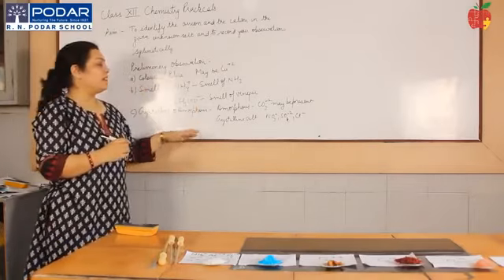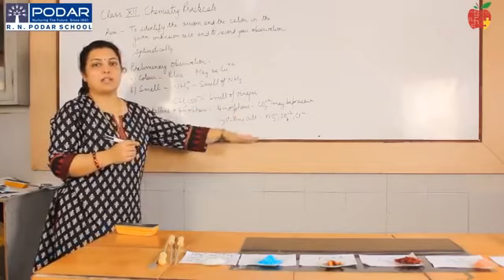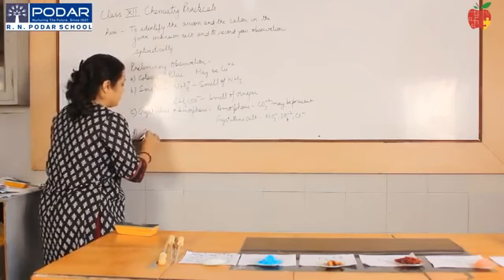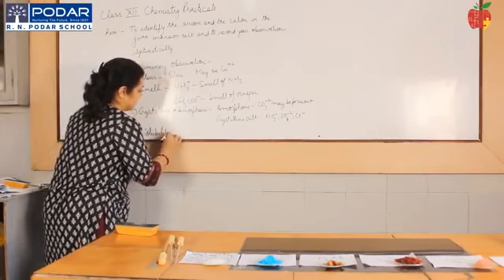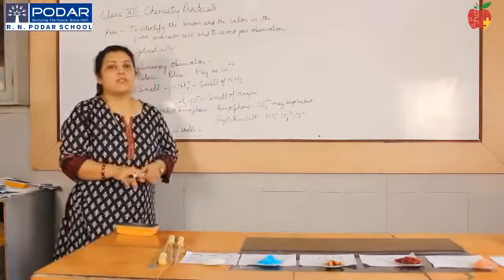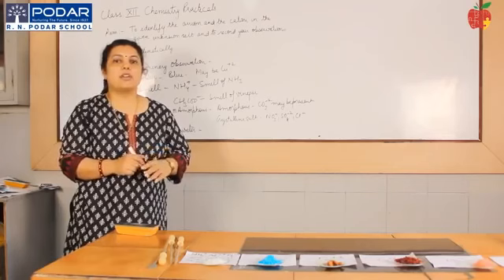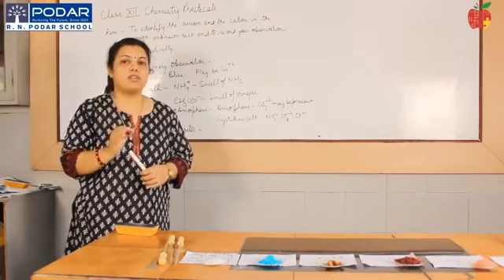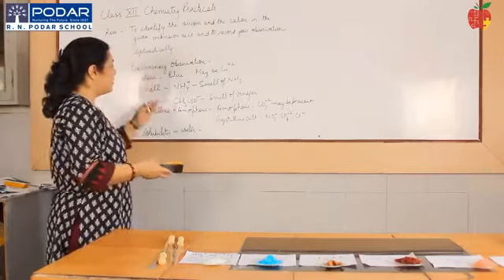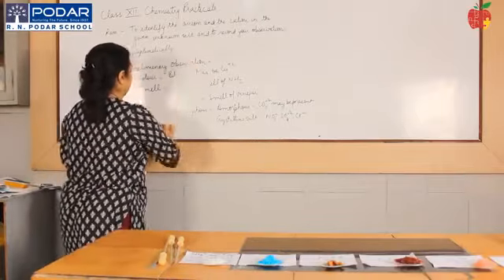Okay, now this is only certain hints to tell you what it can be. You can't say something which is crystalline has to be nitrate or has to be sulfate. This is just a guideline. And the last thing that you see is your solubility in water. Now most of the salts which are provided to you are soluble in water. Water insoluble salts are no longer in your syllabus, so the salts which we provide you should be soluble in water to a large extent. Okay. So once you have noted down your preliminary observation, then we move on to the anion analysis.